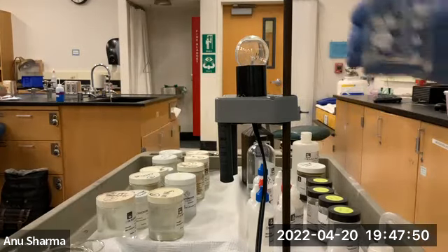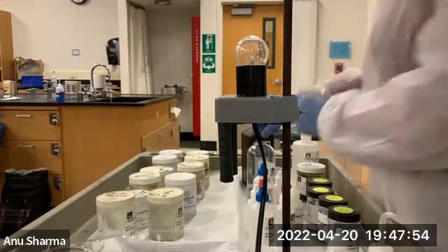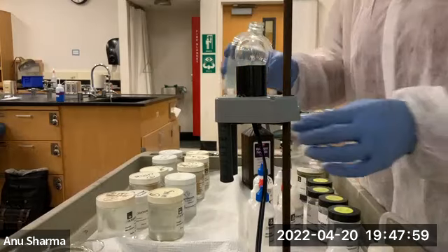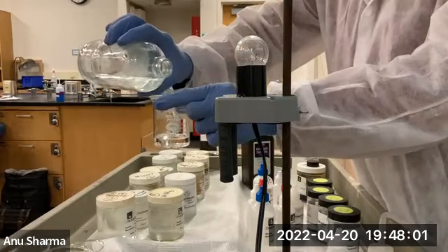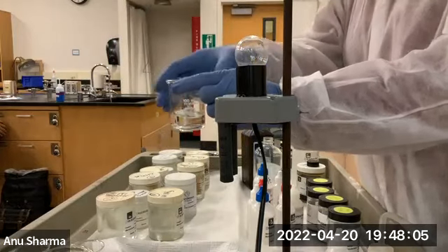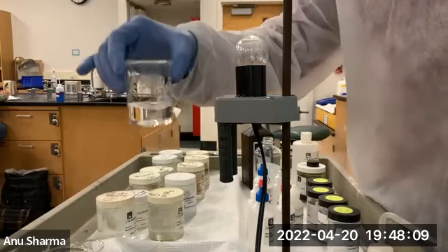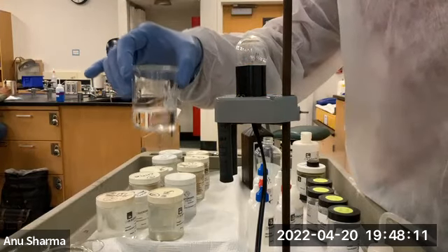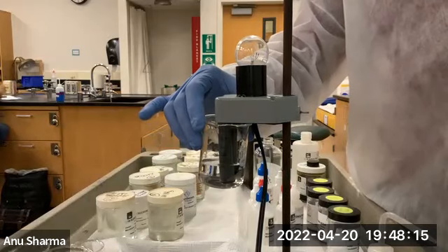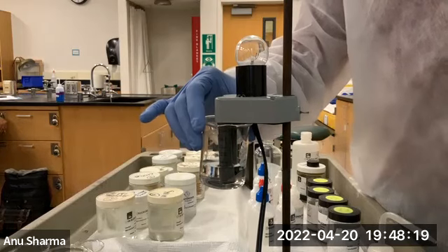So, solubility in water: here I dissolve it in water. Yes, due to hydrogen bonding, it will dissolve. Nice clear solution. Put it in this system here. No, it's not conducting electricity.